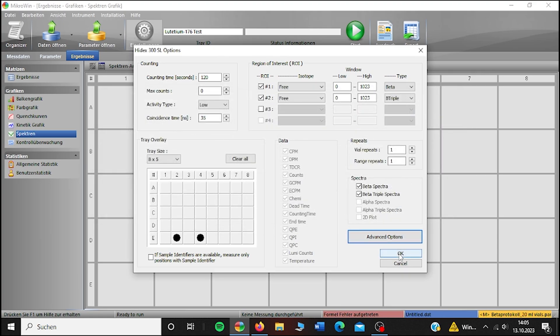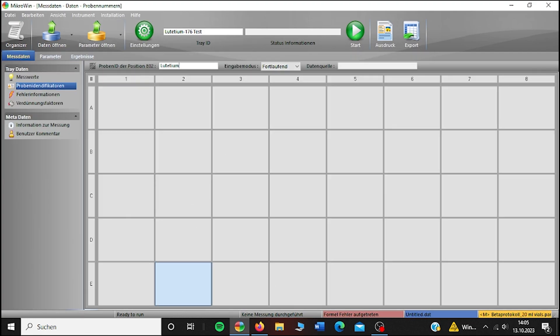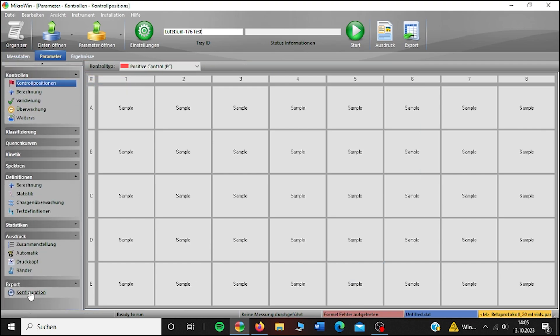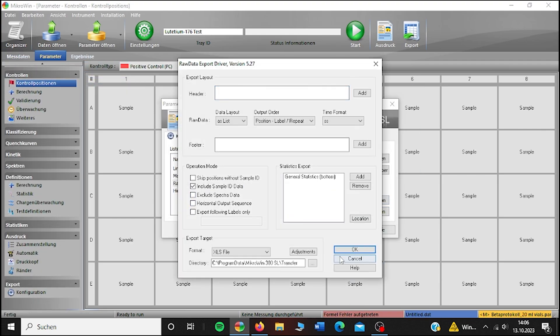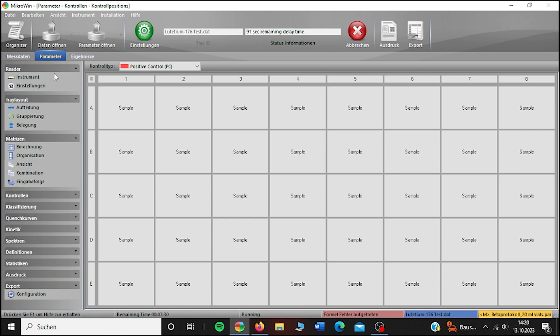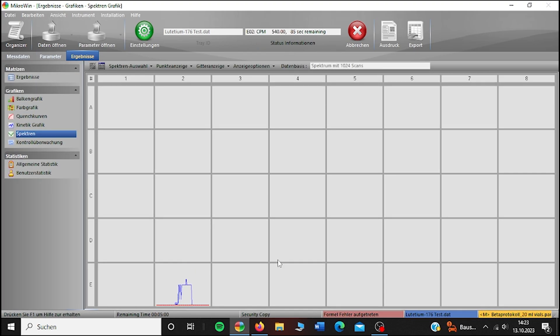Once everything is set, under measurement data, click and correctly name the fields. Under parameters, do not exclude raw export driver and spectra data. And once all the delays are finally over, you will get the first results under results.